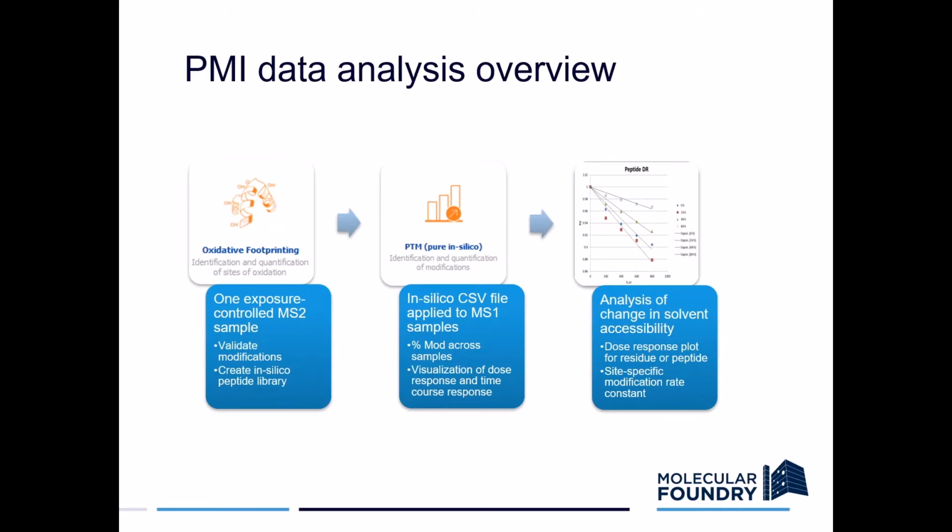Before I start the demo, I would like to give a brief overview of the two workflows we use in Byos. The data analysis process I'm sharing with you today has worked well for us, but I should point out that there are several ways of working with in silico peptides in Byos.